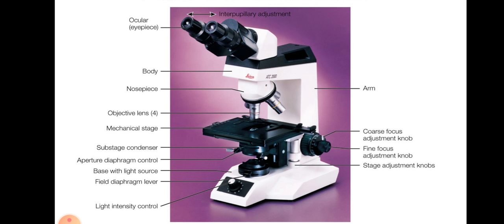On the other side we can see the arm, coarse focus adjustment knob, and fine focus adjustment knob. There are 2 knobs here, and here we can see the stage adjustment knobs.